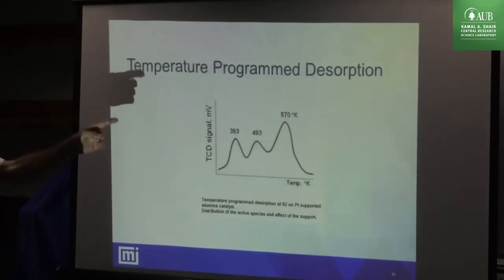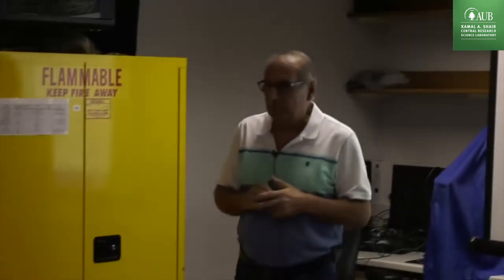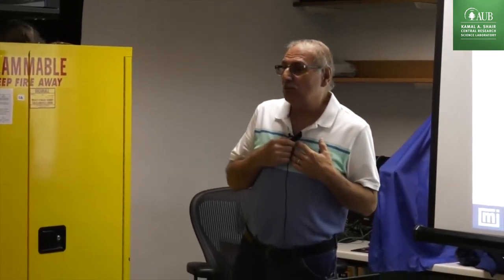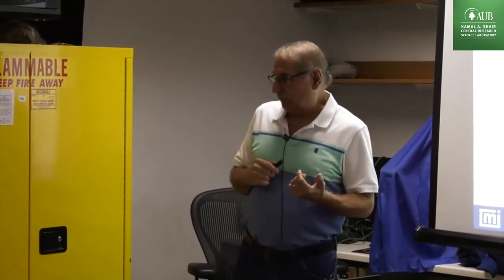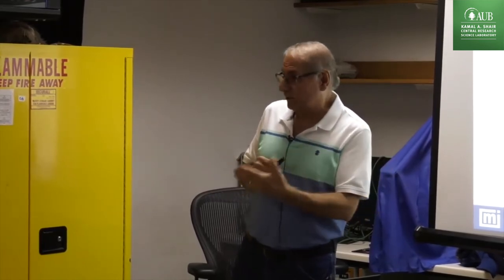Temperature programmed desorption is very important, okay? Suppose you'd like to run a reaction for the hydrogenation of benzene, an easy example. I don't know which temperature I have to work at. How do I know if it's 400 degrees or 350? Everyone tells you a different temperature. But you cannot guess. In catalysis, you cannot guess. You need something to prove that your reaction is good.